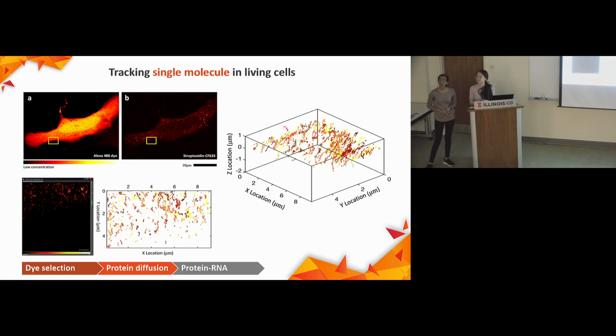If you have two fluorophores, then the ratios between the center and the outside points are not the same as if there's one fluorophore. There's a whole list of those kinds of things that you can check to verify that each track is a single molecule. So what they said was correct, and that absolutely works.